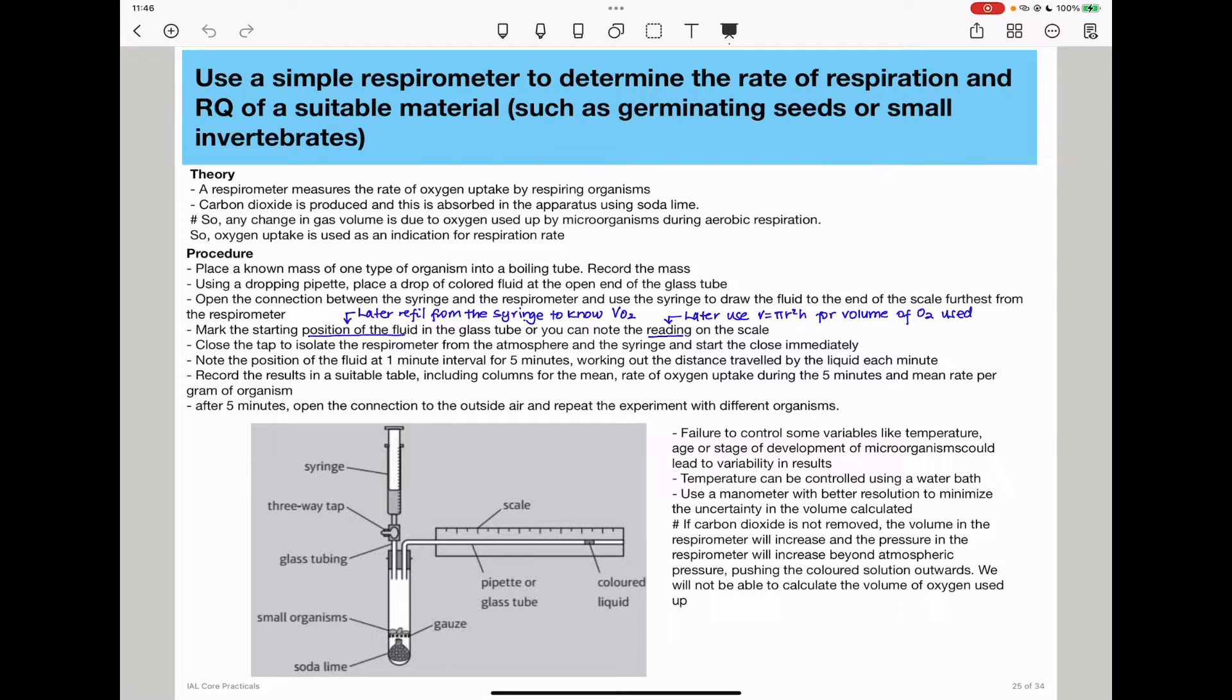There are two methods you can use to determine the volume of oxygen used up. Either you can open this tap so that more oxygen comes in to return the colored solution to its original position, and then look at the syringe to know how much volume has been used to refill. That would be the volume of oxygen used up by the organisms within a specific time.